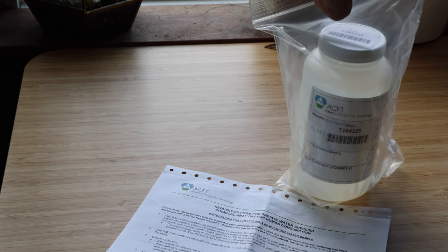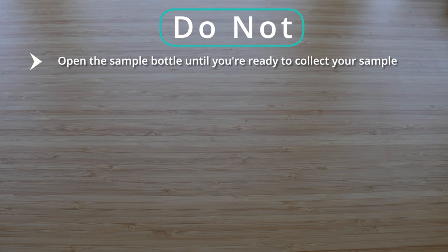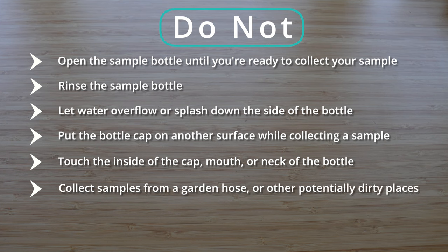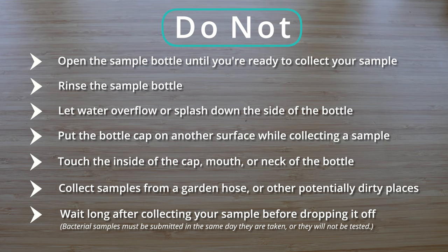Before you go, here are some important notes to follow throughout this process. Do not: open the sample bottle until you're ready to collect your sample; rinse the sample bottle; let water overflow or splash down the side of the bottle; put the bottle cap on another surface or touch the inside of the cap, mouth, or neck of the bottle; collect samples from a garden hose or other places that might be dirty; or wait long after collecting your sample before dropping it off — bacterial samples won't even be analyzed if they're not submitted the same day they are taken.